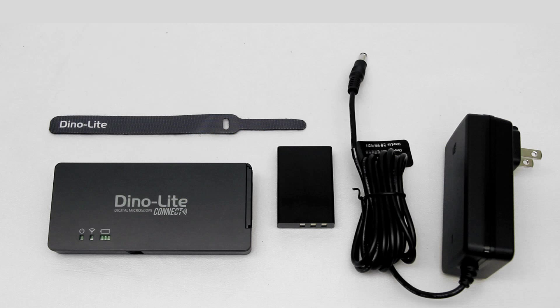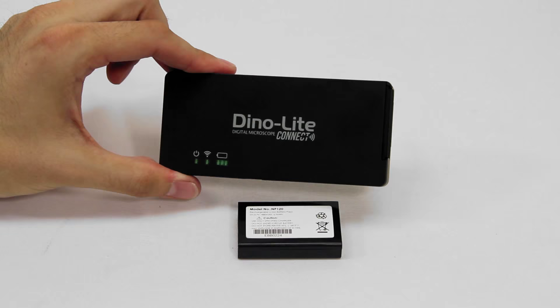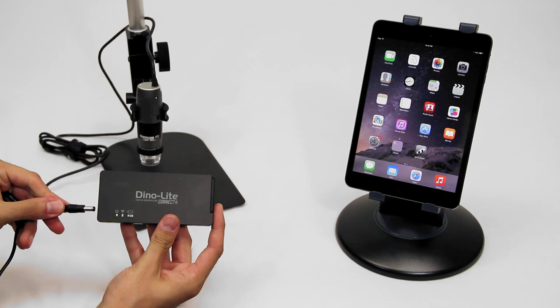Included is a rechargeable lithium-ion battery and an AC adapter. Simply insert the battery and the Wi-Fi adapter can be used while plugged in with the AC adapter or wirelessly using battery life.